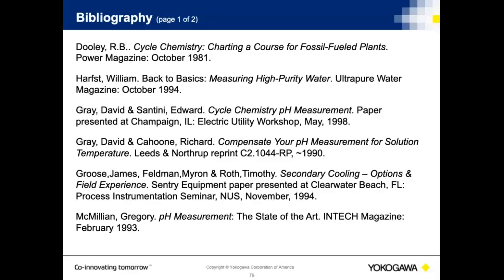Okay, thank you. And we have one more question, which is perfect timing. Is there a way to regenerate contaminated probes? Not in the case of the reference probe that we spoke of, the Bellomatic electrode or the flowing junction where I have a chamber filled basically with potassium chloride. Those are really the 2 refurbishable ones.